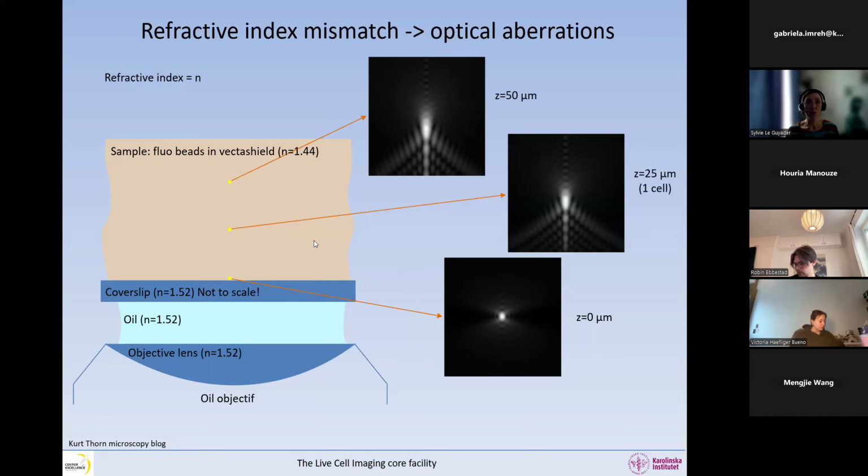And in this sample, we're lucky because the sample has the same refractive index everywhere. But if it's a heterogeneous sample, which is what our samples really are, then it's even worse. So we're going to have a little workshop this afternoon with JJ Jinzhong, who will demonstrate this to you.